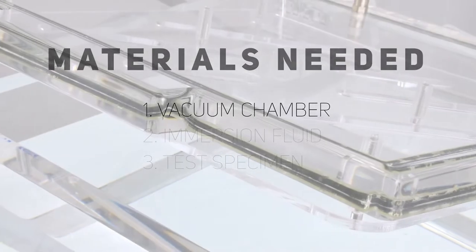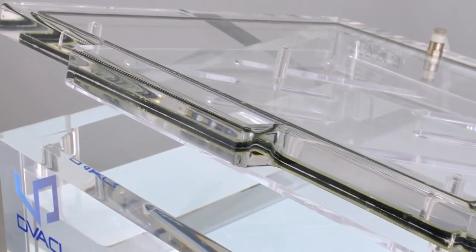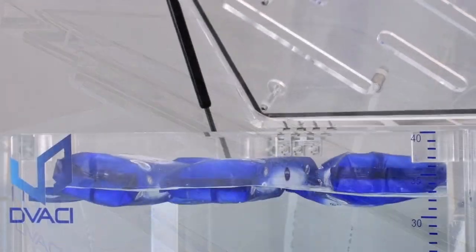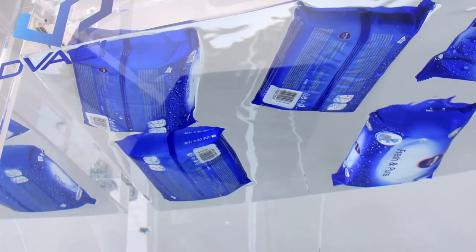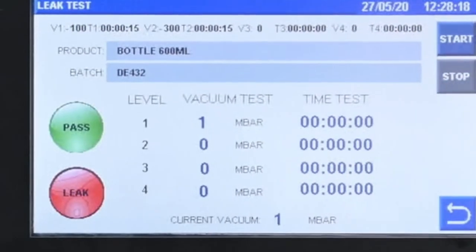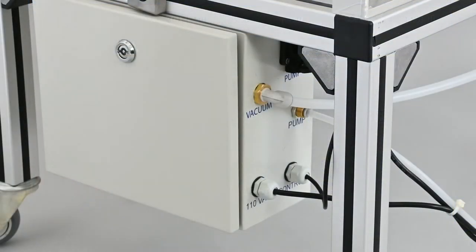According to the norm, a vacuum chamber is any transparent container with a lid, a transparent plate to keep the test samples underwater, a vacuum gauge, and an inlet tube from a source of vacuum.